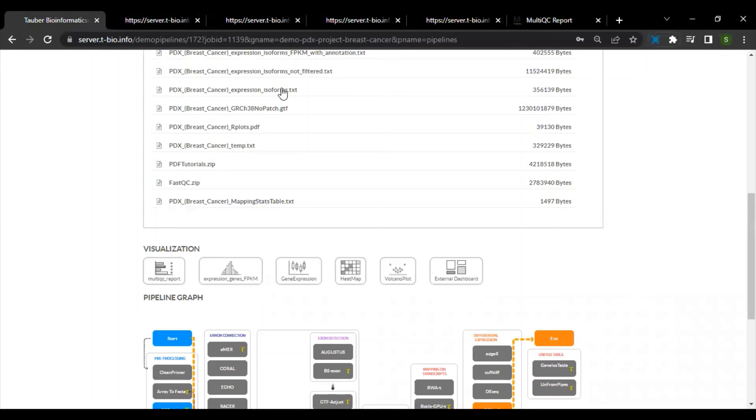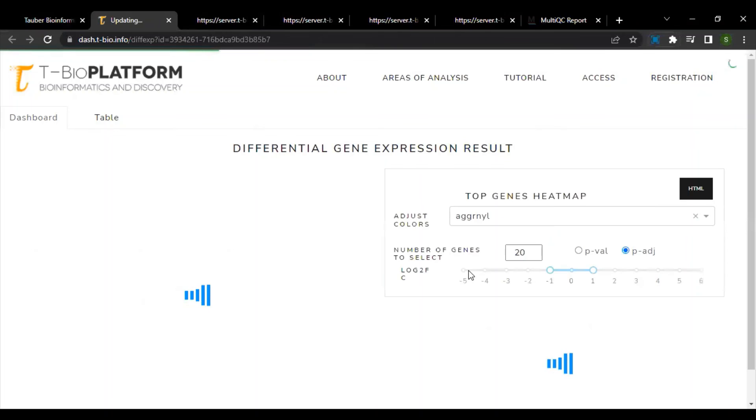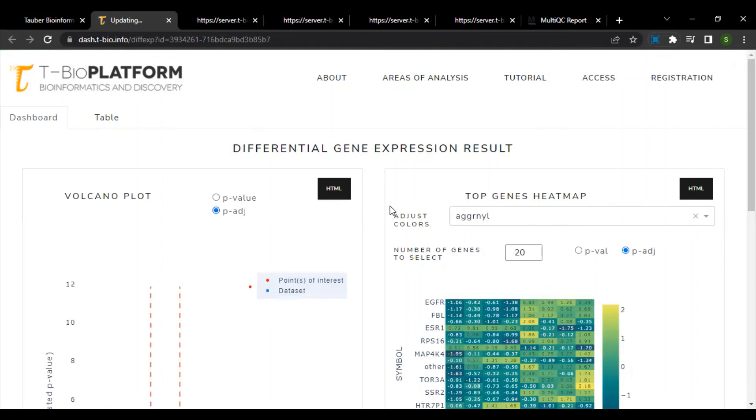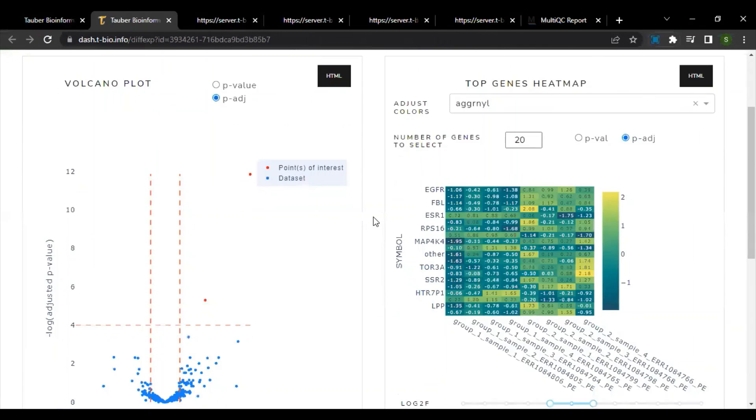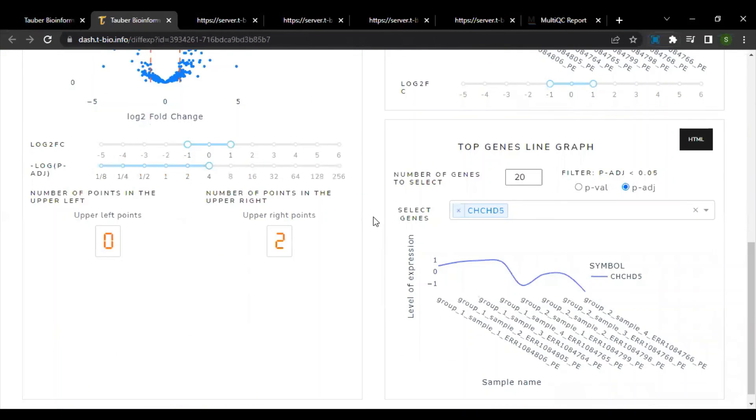Finally, we also have an external dashboard that allows all the tables and graphs to be maintained in a shareable format. This also contains all the important graphs and tables such as volcano plot and heat map that we have discussed previously.